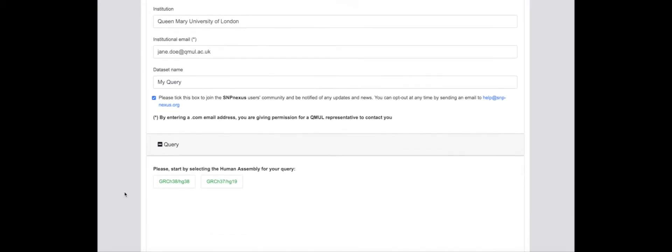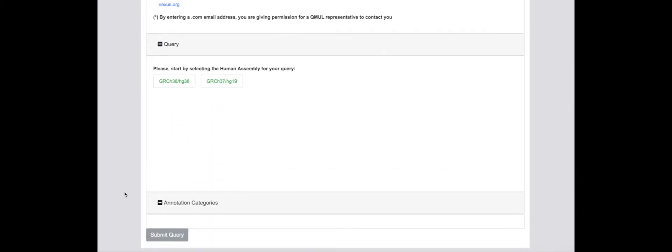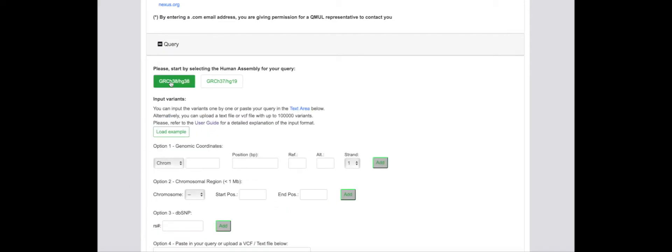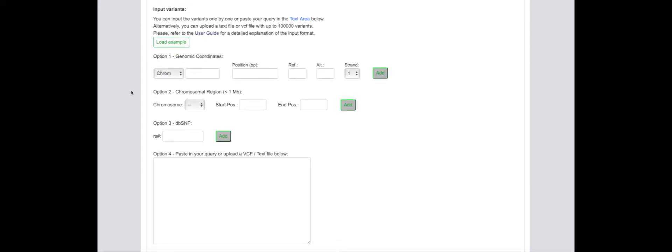The next step is to select the genome assembly, either hg19 or hg38, in the user interface. The query input form and set of annotations available for each assembly will be displayed after the selection of the relevant assembly.